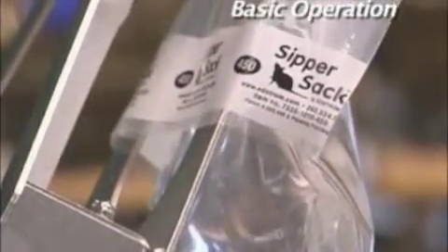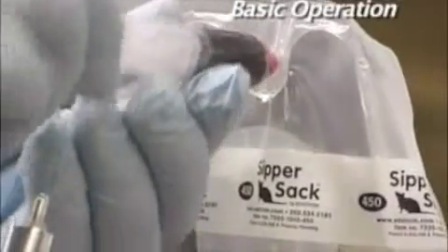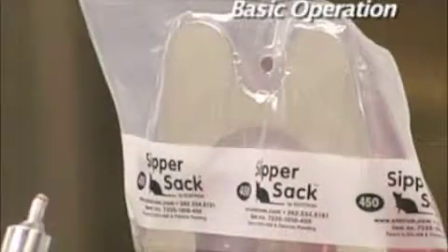When the Sipper Sack has reached its capacity, the filler will automatically shut off and the filler head can be disengaged. If water-soluble compounds need to be injected, this can be done directly through the fill port on the Sipper Sack before inserting the drinking valve.